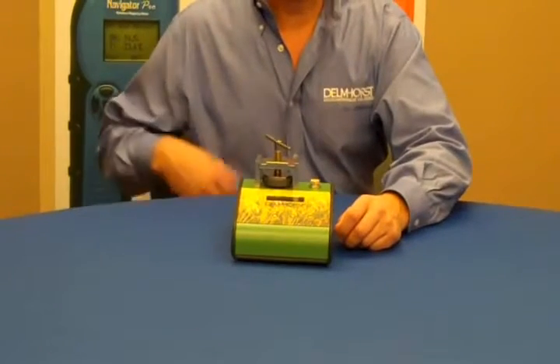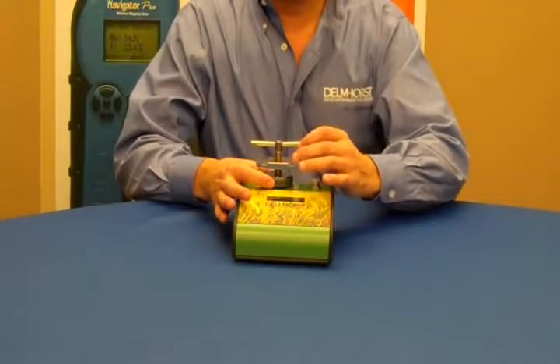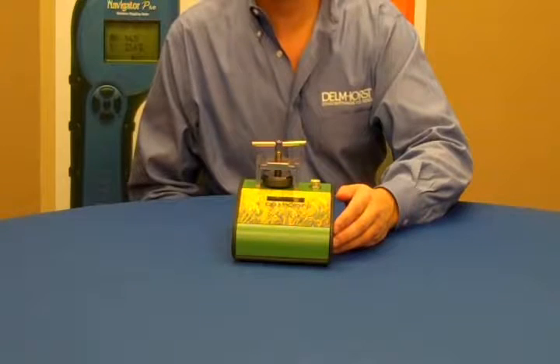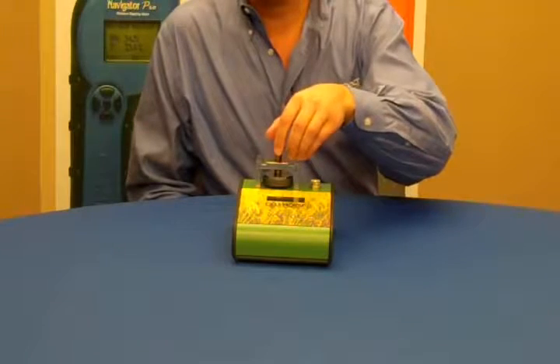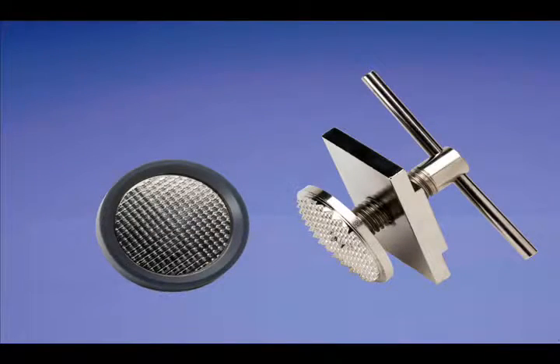To take a reading, you use the double disc pressure type electrode where the lower disc forms the base of a shallow cup in which the grain sample is placed. The upper electrode screws down over the sample cup. Both discs have sharp points that penetrate the seed coat and make contact with the interior of the grain.